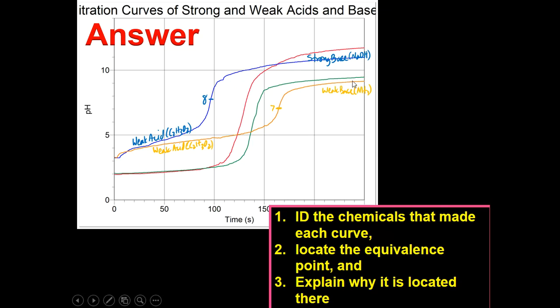You can tell because it doesn't go very, very high. It's below, in the category of under 9, so that's closer to 7, so that's your ammonia. And if I got a weak quarterback with a weak receiver, that means that any of the protons that go out will be gobbled up, but not many of them are going out. So that means that I'd end up with a pretty good match of about 7. A really bad quarterback, really bad receiver, you're not going to get a lot of protons floating around in solution, right?